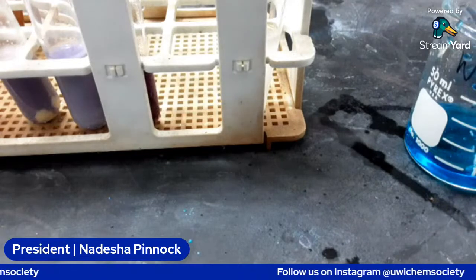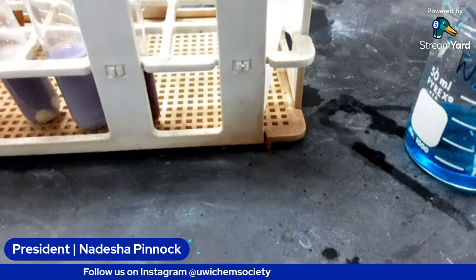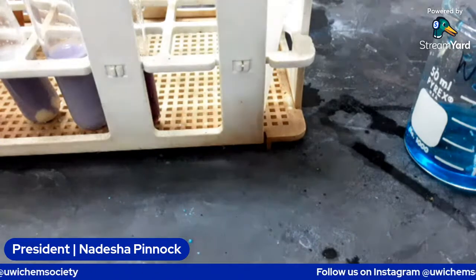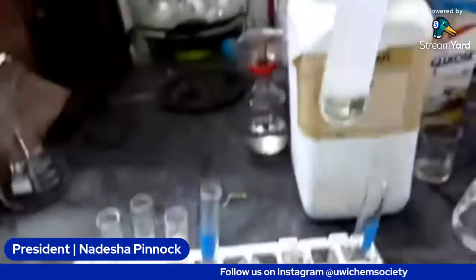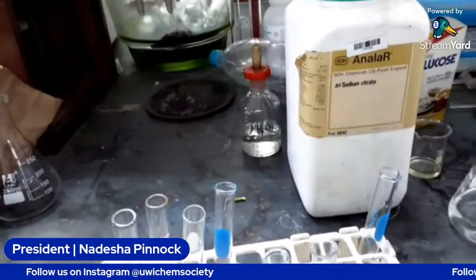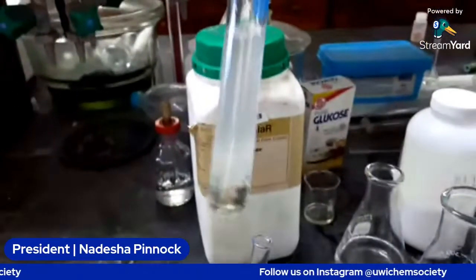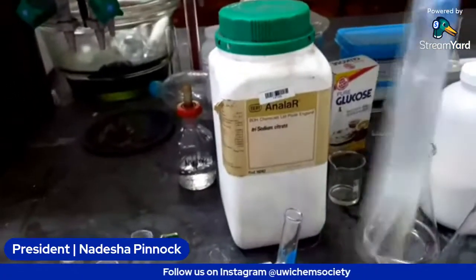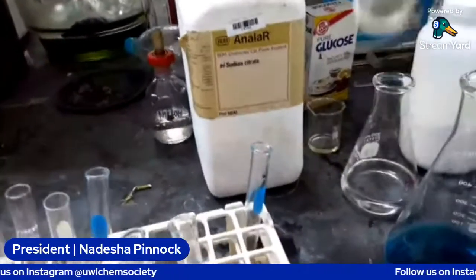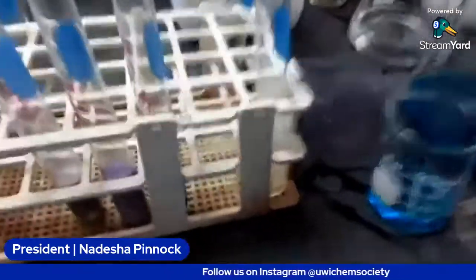That's 1, 2, 3. All right, so this is what it looks like. I'm going to try to mix it around. As you can see, it's kind of separate. I'm trying to mix it so that the oil can go into the ethanol. Maybe I should use the stirring rod to do that.